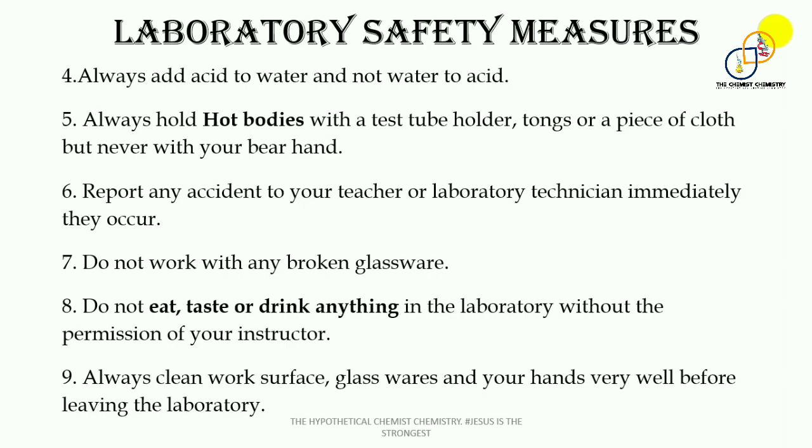The fifth point is always hold hot bodies with a test tube holder, tongs, or a piece of cloth, but never with your bare hand. Don't try to hold any hot object with your bare hand. I believe that even in our homes, when we find ourselves in the kitchen and we are preparing food, we don't hold it with our bare hand when it is hot, but we use a piece of cloth or a napkin in doing that.